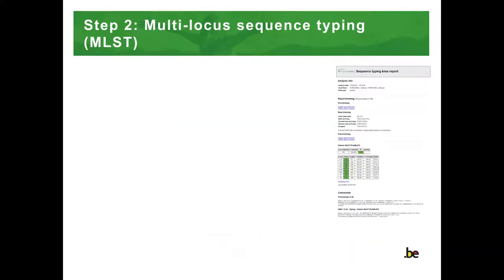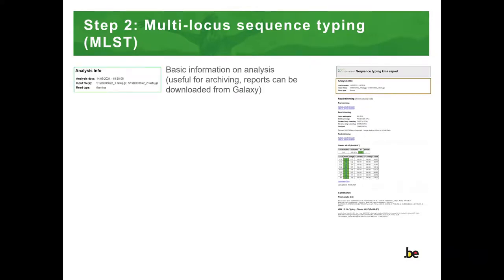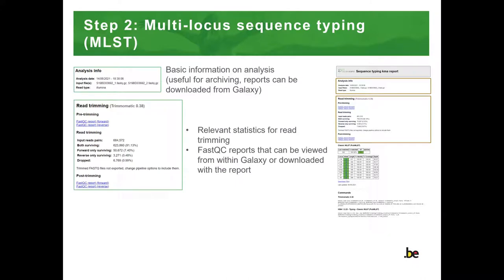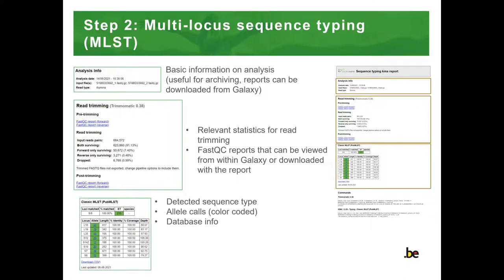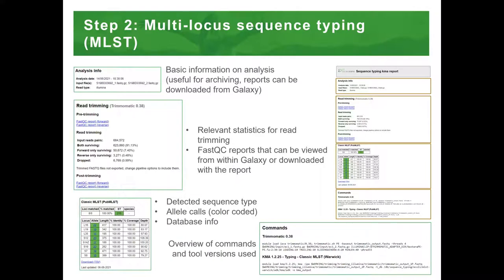The output of the tool is provided as an interactive HTML report, which can be viewed from within Galaxy. The report contains various sections, starting with the analysis info at the top. The second section contains FastQC reports and statistics for the read trimming, which can be enabled or disabled in the tool interface. The third section contains the output of the typing itself — in this case, the sequence type and the corresponding allele calls. At the bottom of the report there is a section containing the commands that were used to obtain the results, in this case for Trimmomatic and KMA.